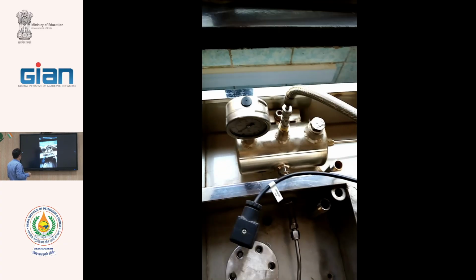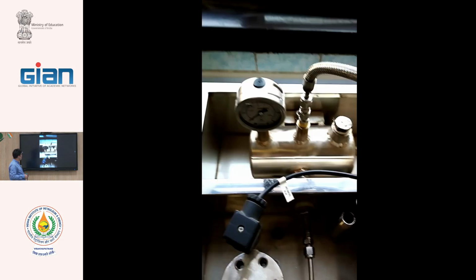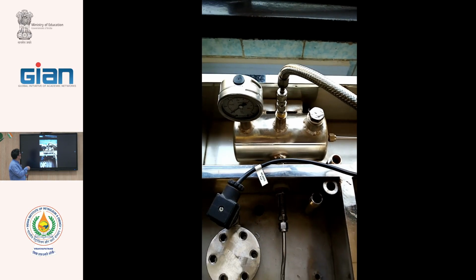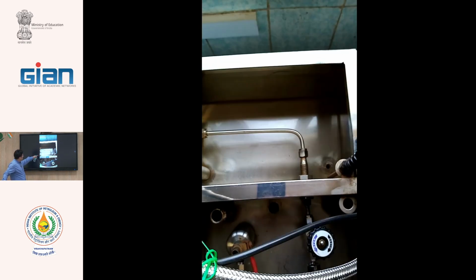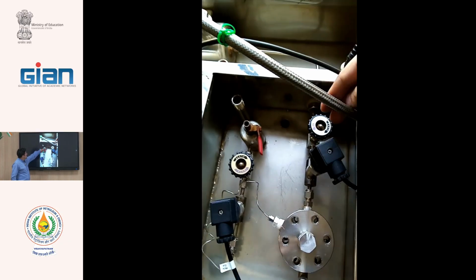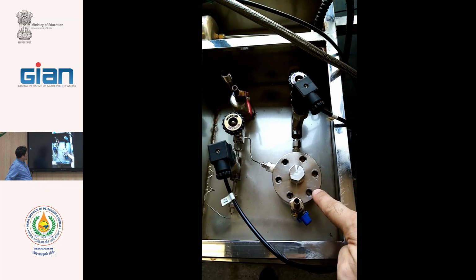After the vacuum, we begin the test. From the capsule, the gas comes here to control the temperature, and next comes to the entrance of the membrane with the opening of this feed valve, at feed pressure.